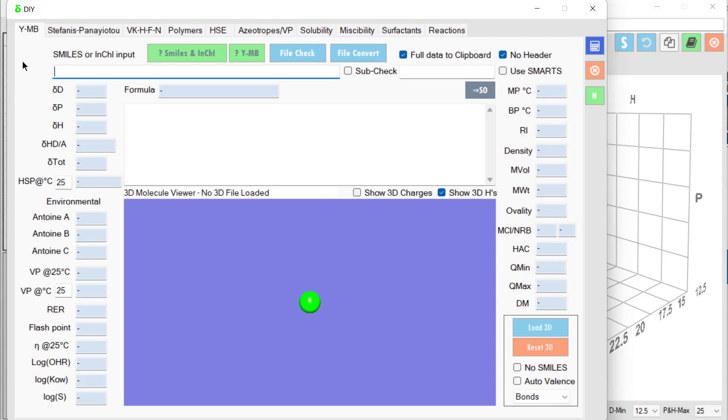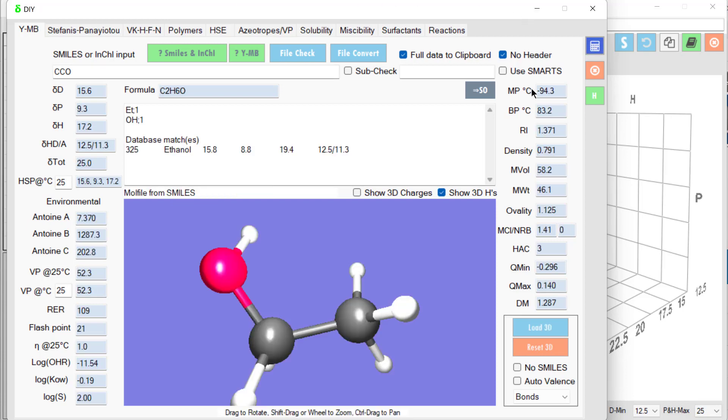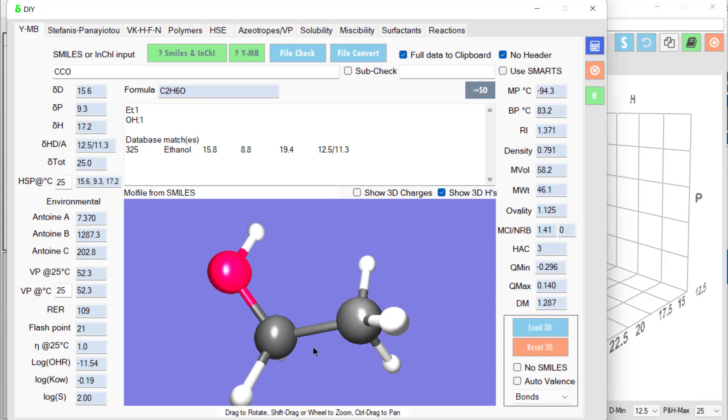We enter a SMILES, in this case CCO, two carbons and an oxygen, which is ethanol. I hit calculate and it gives us the molecular structure of ethanol, which is useful, and it tells us that the estimate is 15.6, 9.3, 17.2.